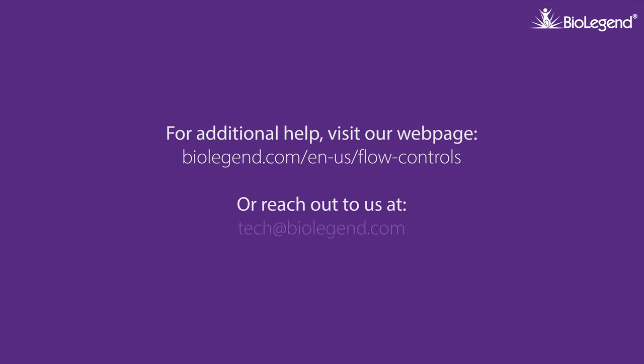So in today's video, we discussed gating and staining controls. If you have any additional questions, feel free to reach out to tech@biolegend.com.